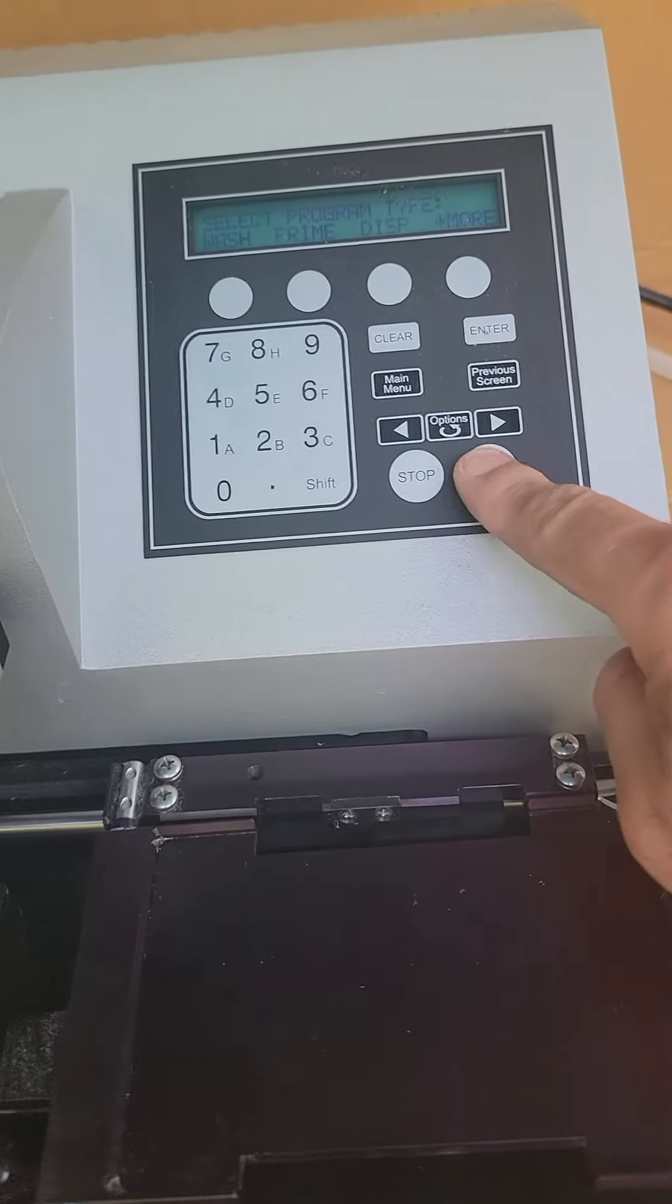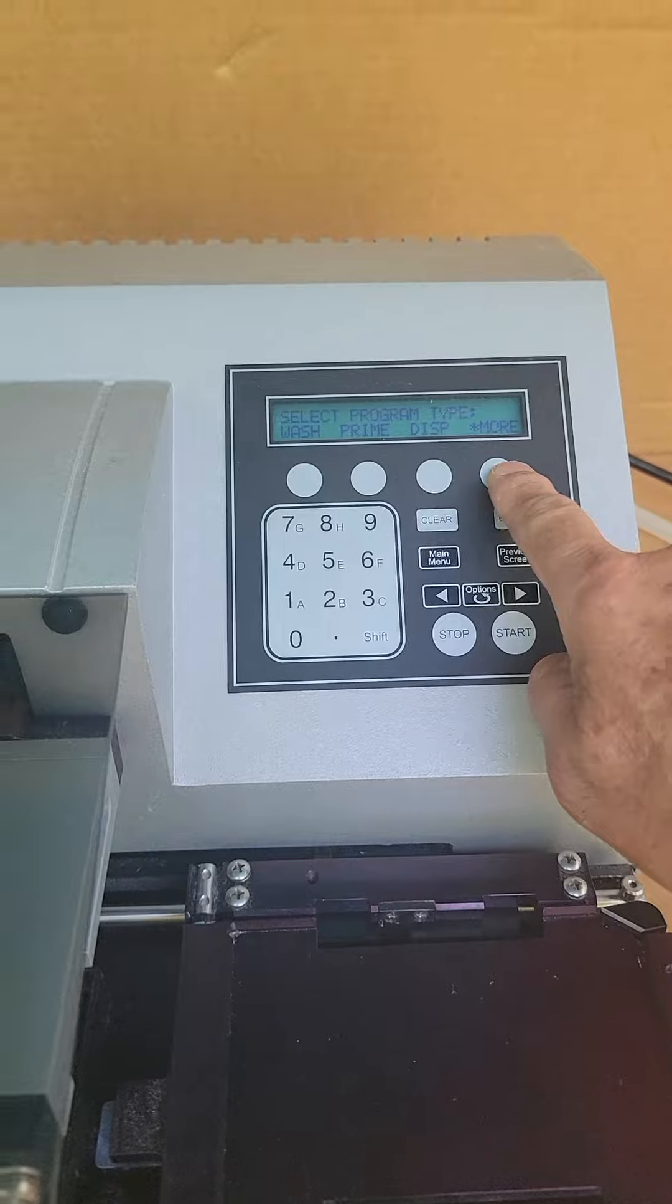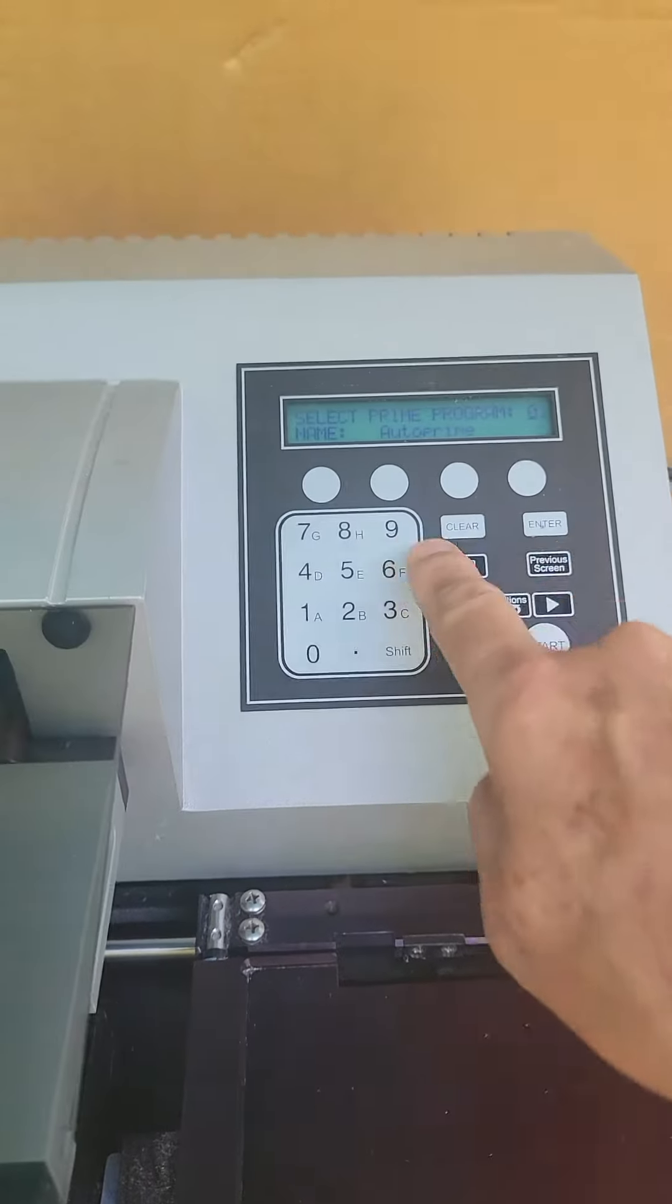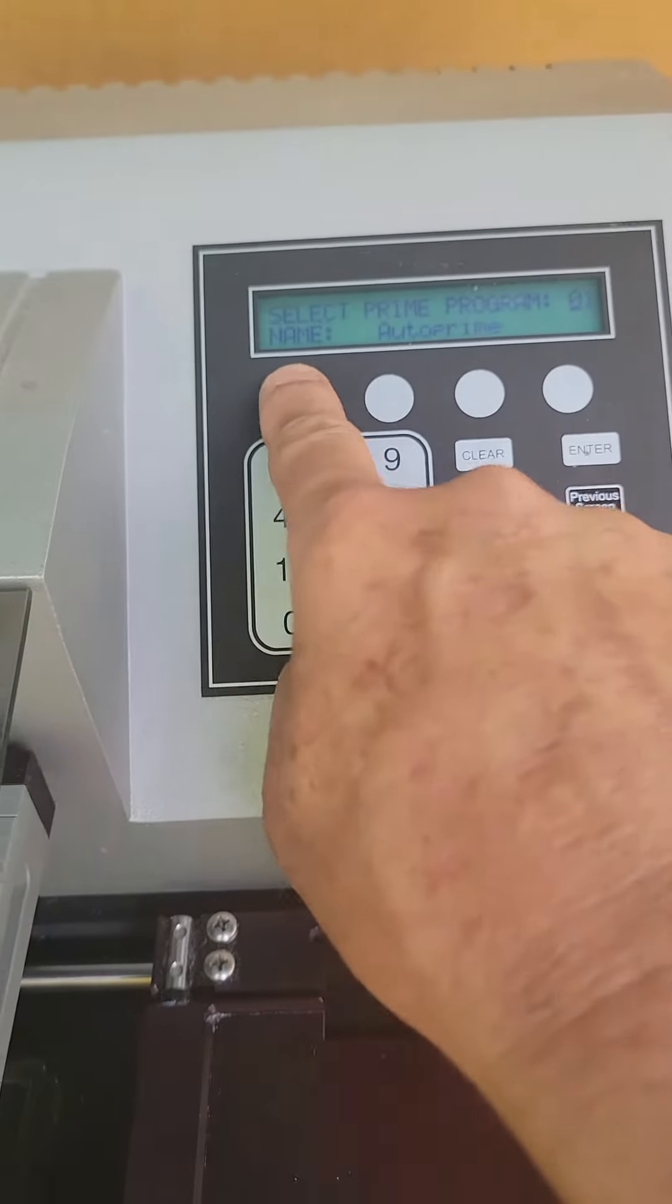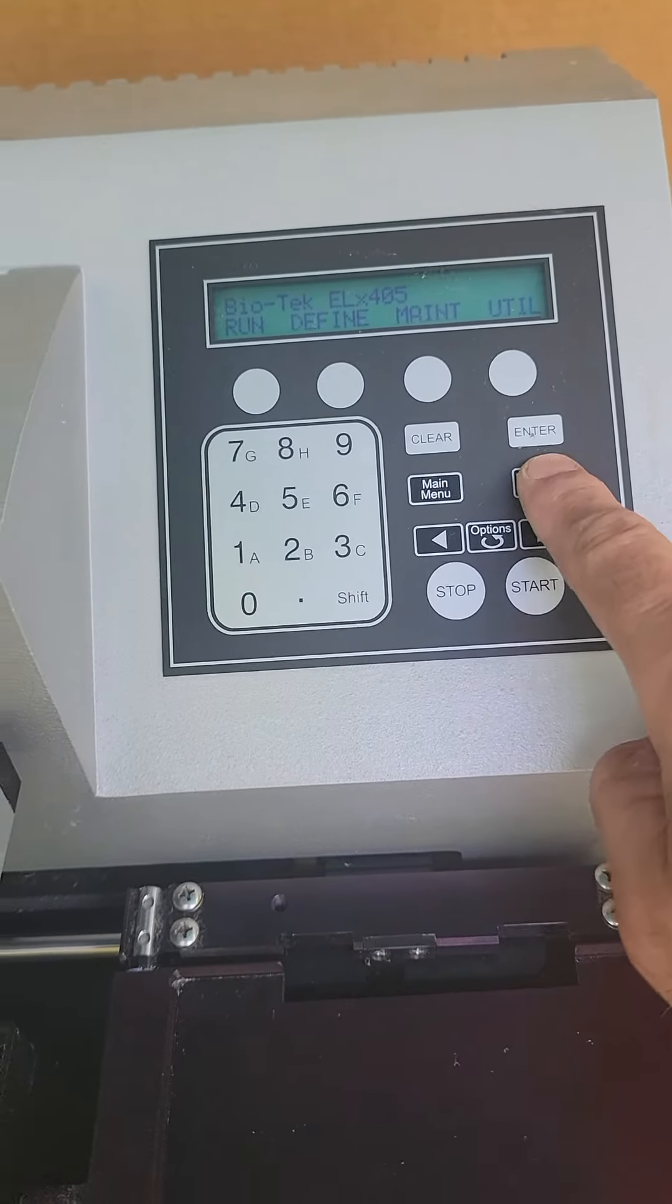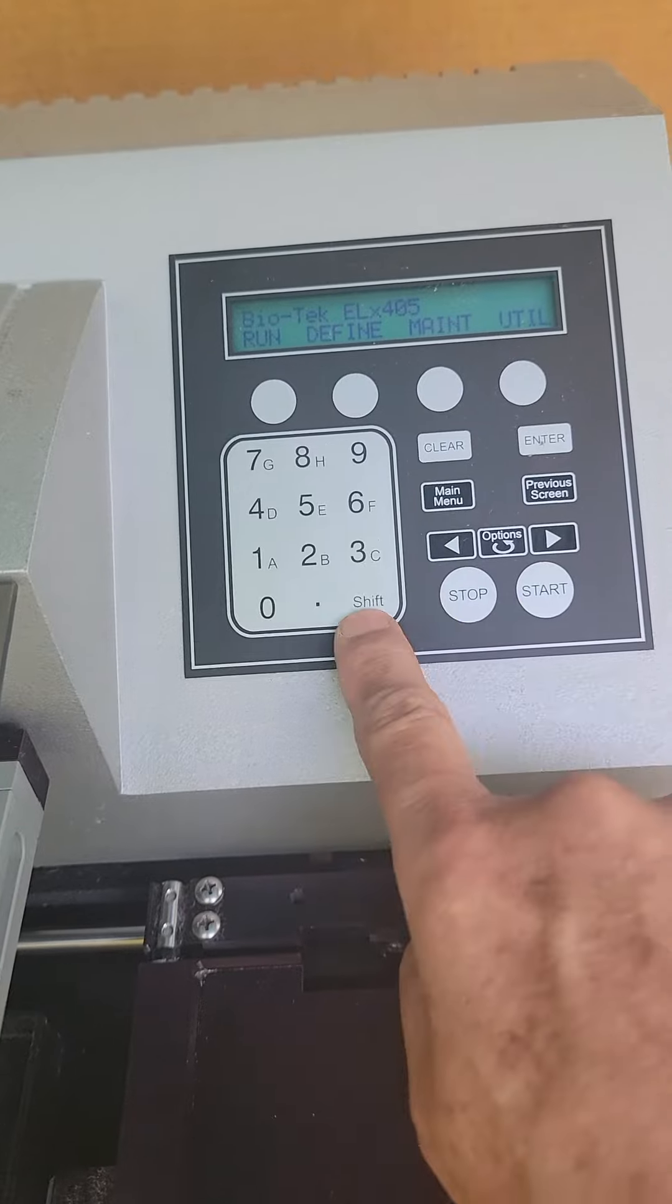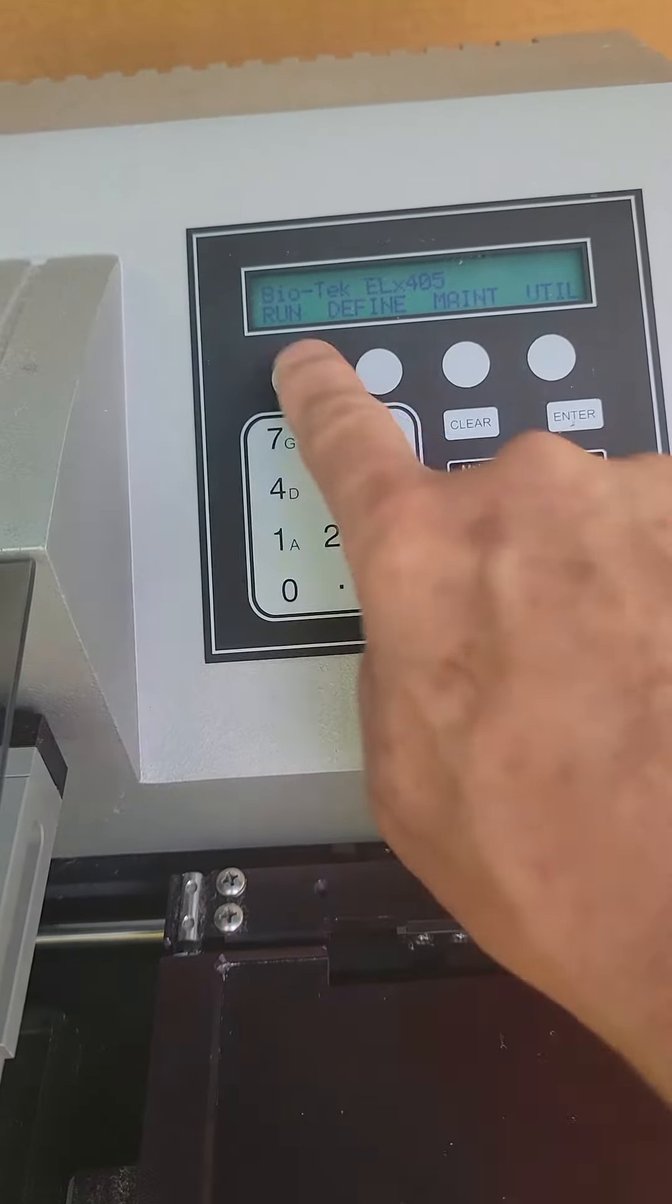And it does respond, as you can see. Responds to all the programs. Main menu, goes back, previous screen, stop, shift, of course.